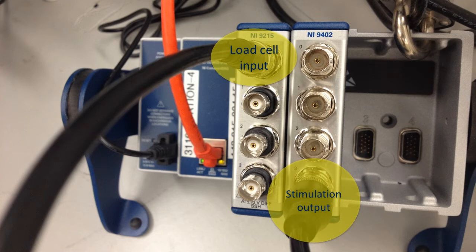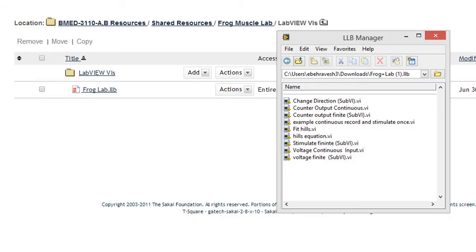Once you've connected the wires, turn on the stimulator. You can find an example LabVIEW VI for this module in the shared folder of T-Square under the resources section. Open the frog lab LabVIEW library file and find the example stimulation VI. This VI is the only VI that you'll need to complete the length-tension deliverable.